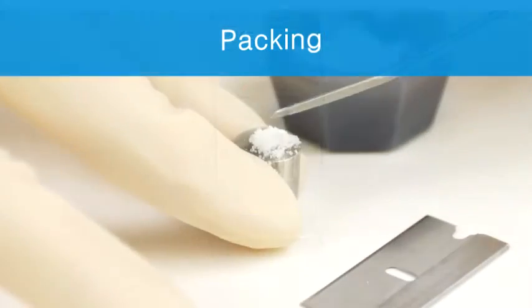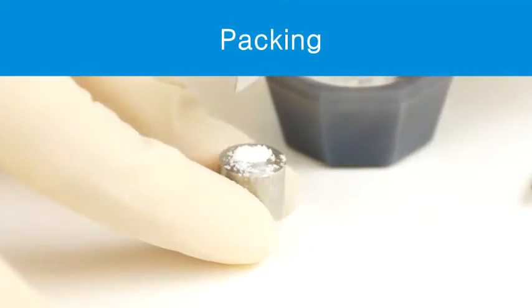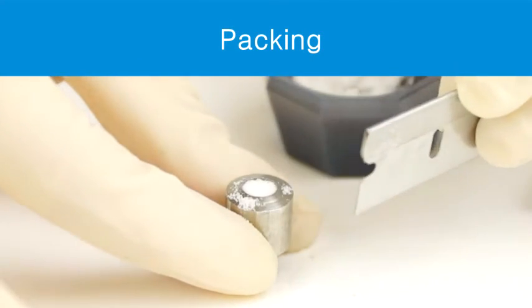Packing. The sample should be loose but evenly packed in the sample cup. Be consistent when loading the cups to achieve reproducible results.